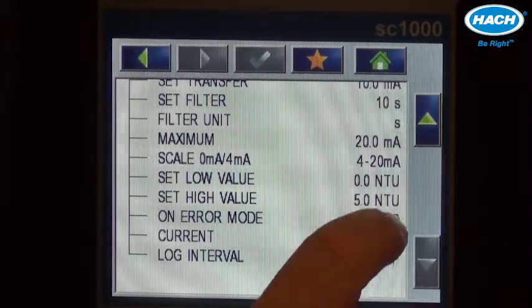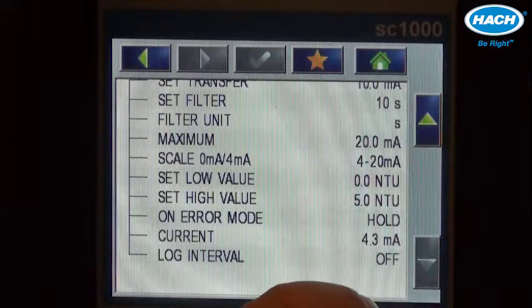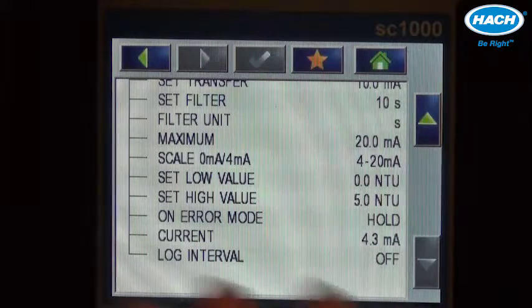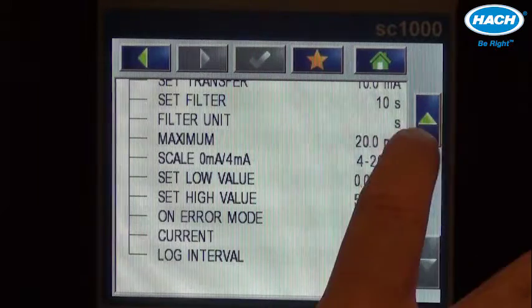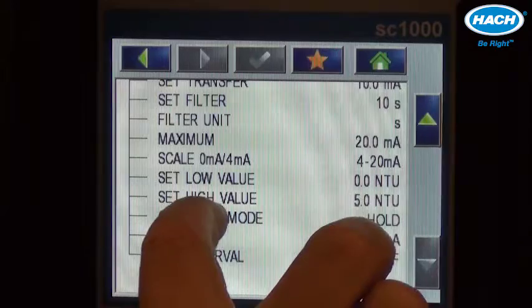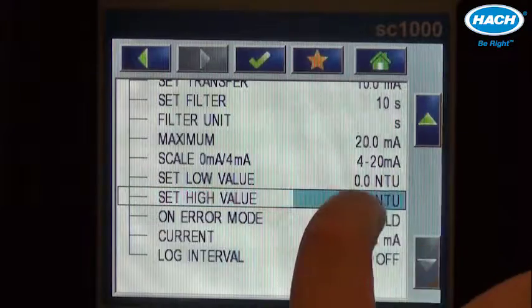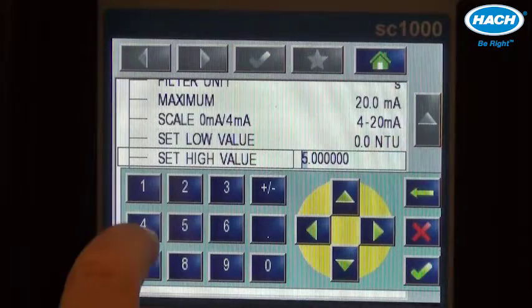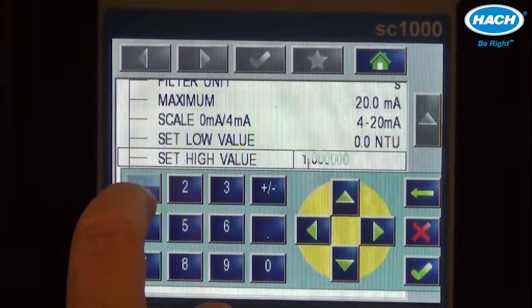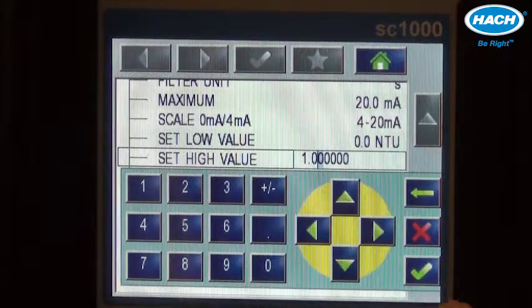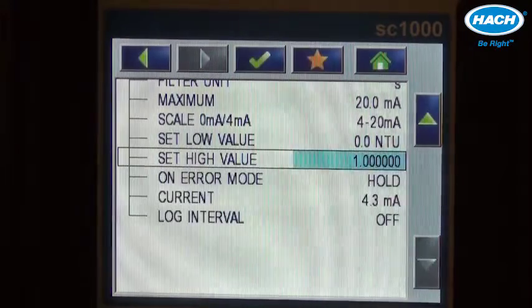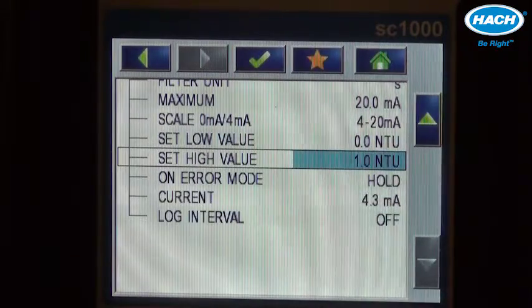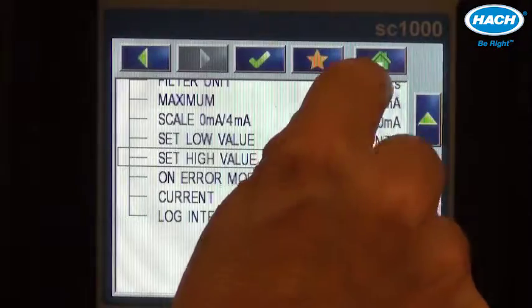The high value in NTU is what will be equivalent to 20 milliamps. And even though the TU5400 can measure much higher concentrations, we are going to change the high value in this case to 1 NTU. So we'll type in 1.0 NTU, accept our work, and that's it.